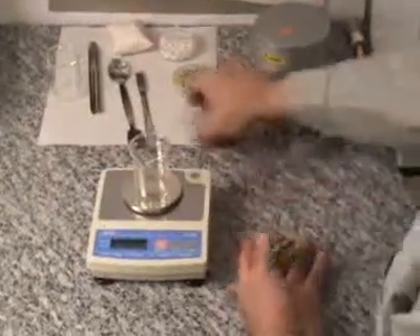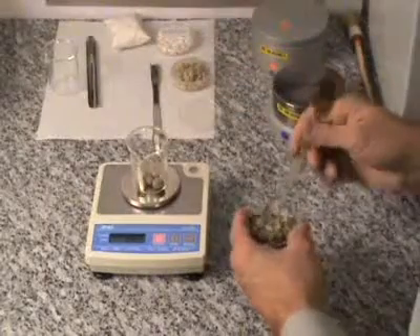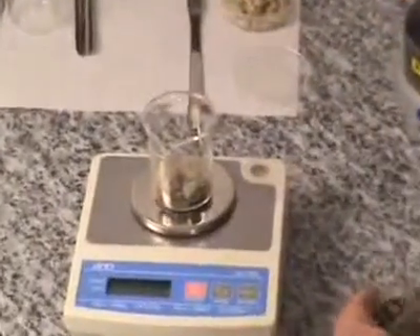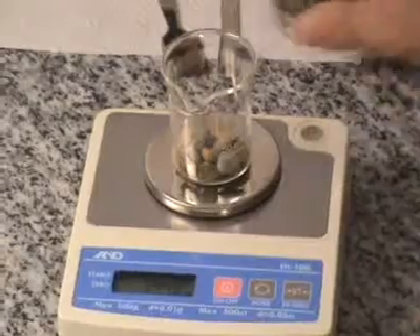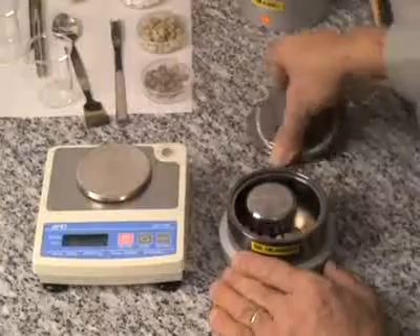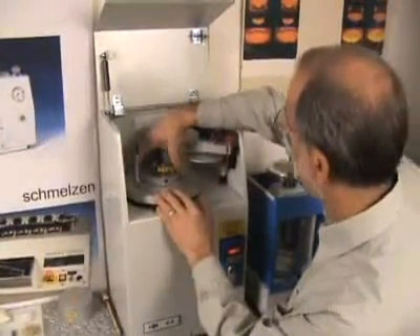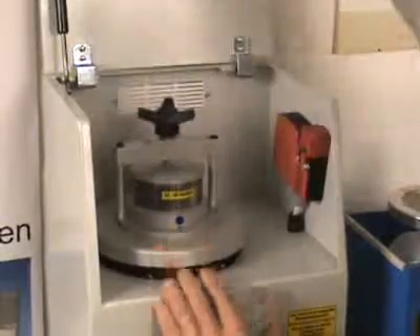Here we are milling about 15 grams of a rock sample. This nitrided chromium 12 grinding vessel is now put into the swing mill. The grinding vessel should not be swinging when the machine is started.